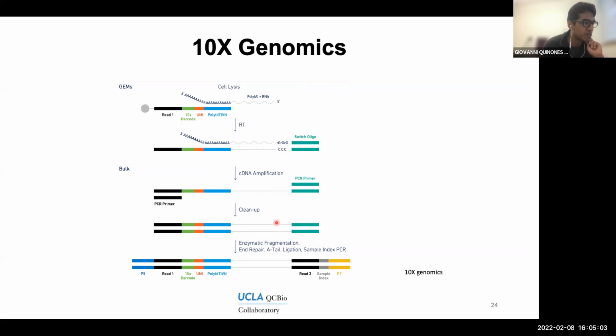In the process of doing this, you are incorporating this sequence that was present in the bead oligo. You're annealing it, you're joining it together with the sequence of the RNA, as you can see, represented by this thin line.